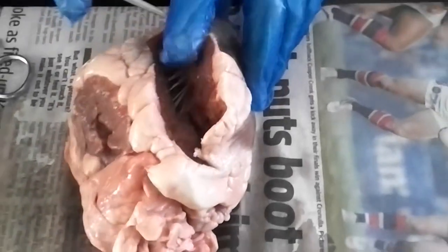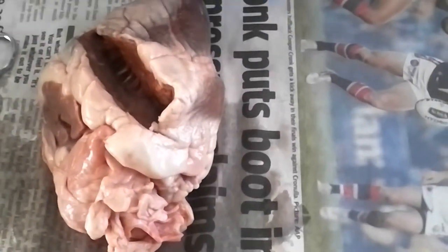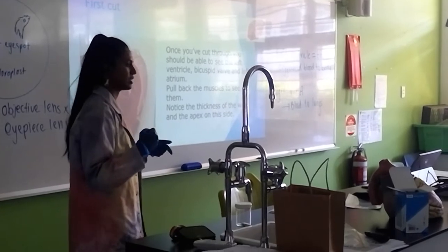This is really slippery. But what do you expect, blood pumps through there? It's like a heart. And this is not a human one. On that heart, so make sure we only got one person cutting at a time.